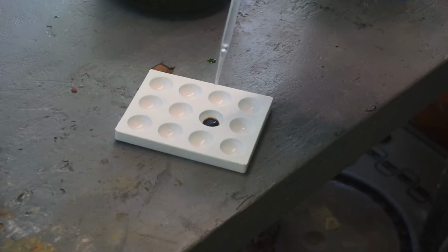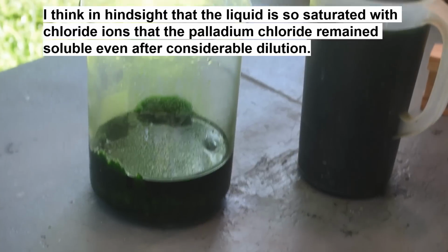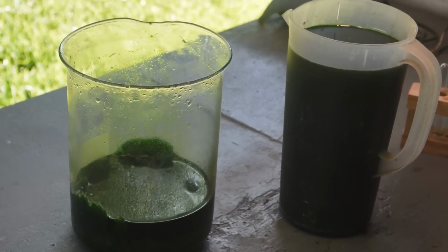Oh, wow, yeah, we still got a lot of palladium in solution. That's great. Okay. So the palladium is still in this liquid for the most part. I'm sure there's still some down there. But yeah, the palladium is still here. All right. So we're leaving a lot of the solids behind, but we got palladium here. That's good. That's great. I'm liking that. Okay. All right. Let me find another container and we'll decant off some more of that liquid.